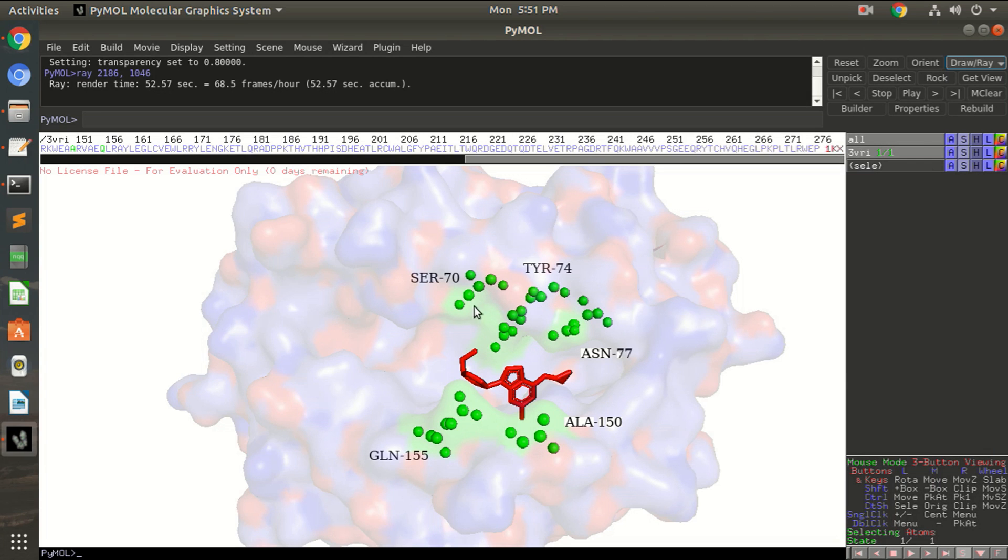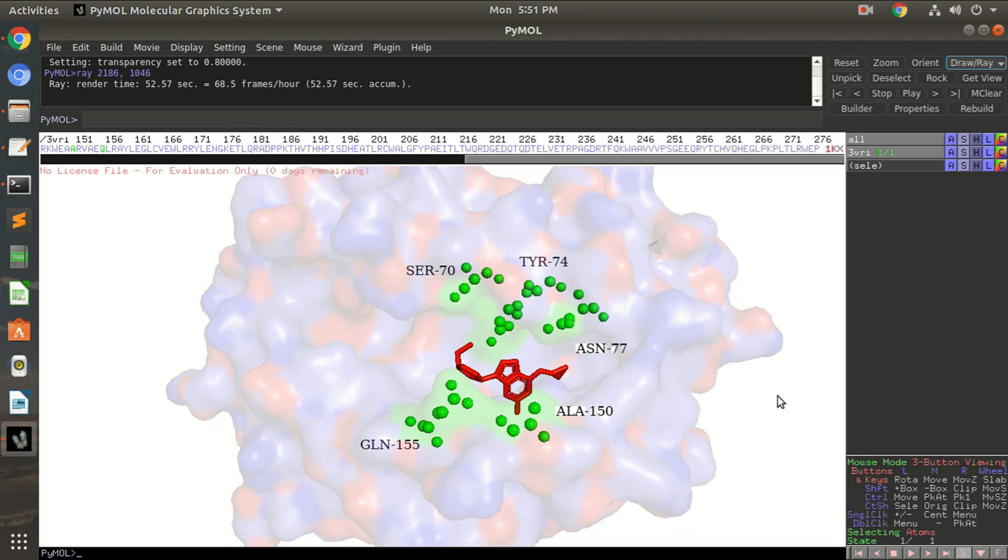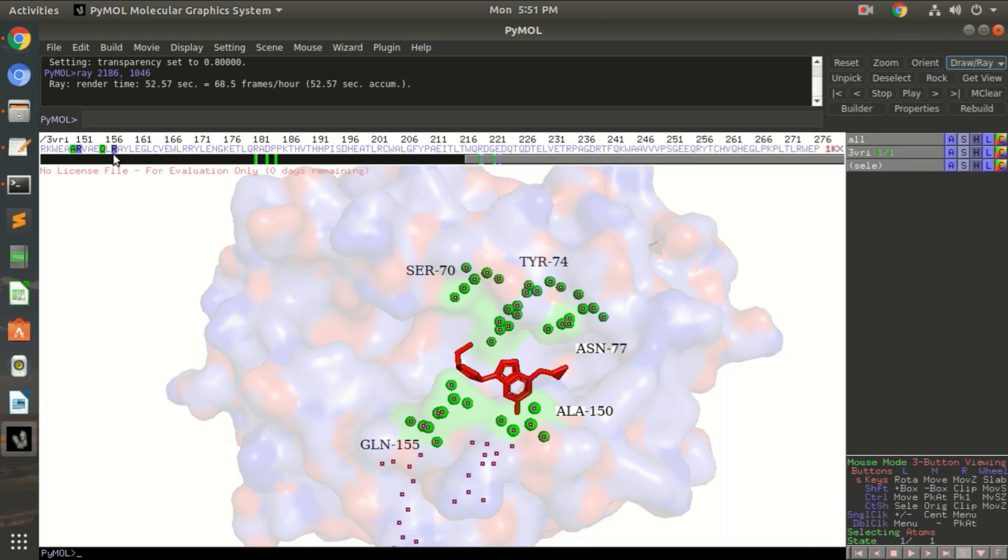So you must be thinking why would you wish to show these interacting residues as spheres. Sometimes it happens that you have several other molecules, several other residues which you want to show in different colors right, besides them.